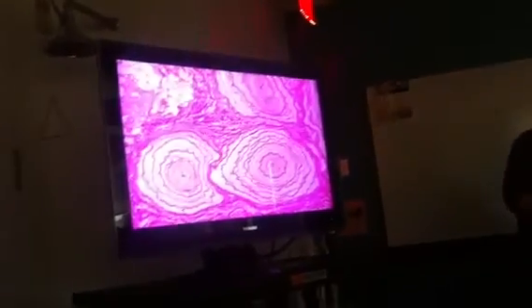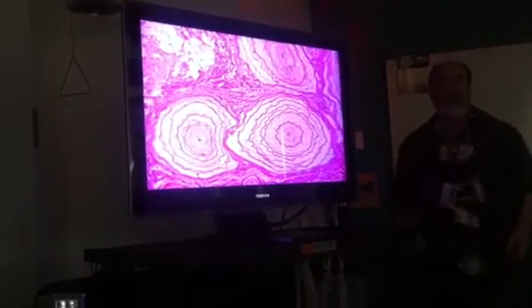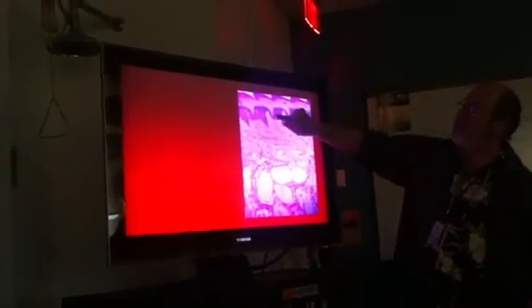When you touch a solid object and you feel it, that's your Pacinian corpuscles triggering. And light touch is the Meissner's corpuscle. Now here you can see the Meissner's corpuscles would be up in these papillae up there, although this slide doesn't have any. And then down here, see, here's the end of the dermis, right? It kind of goes through there.